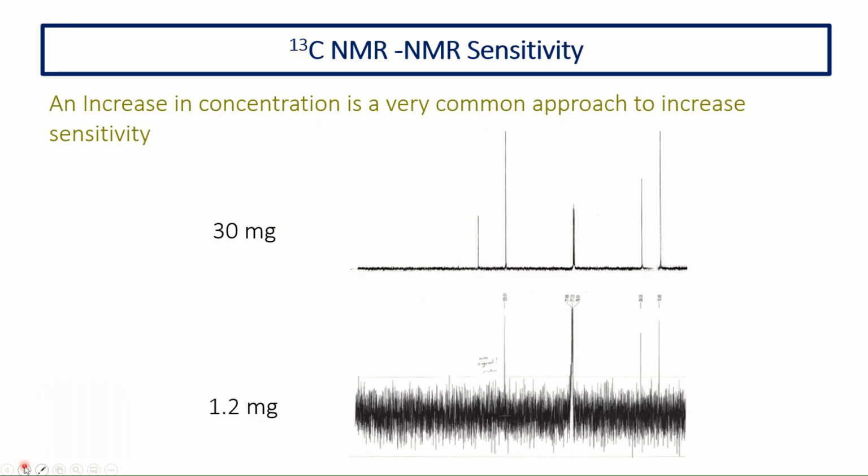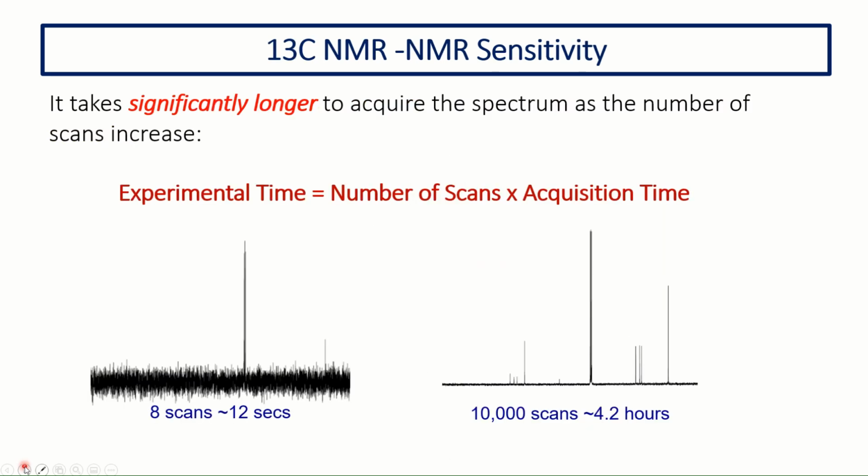So herein, the sensitivity, as I stated before, is pretty poor. And so in this case, I have to use a concentrated sample. Here, for example, again, we see that at the short scan time, the signal is quite poor. The only thing I see here is the solvent that the sample is in. But after we scan for 4 hours, then of course we now see quite a number of different peaks present.